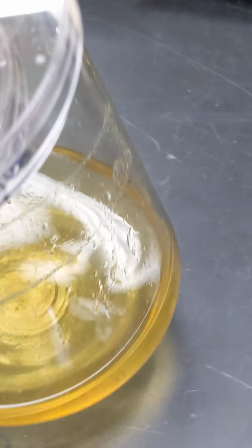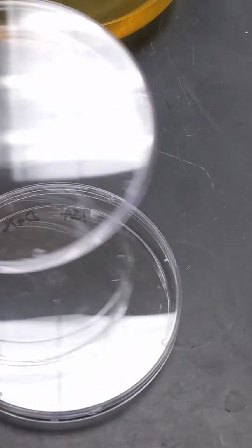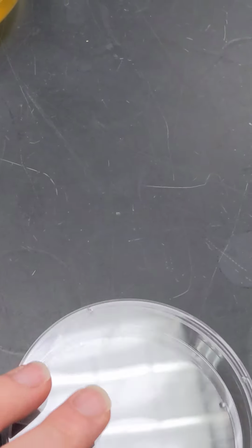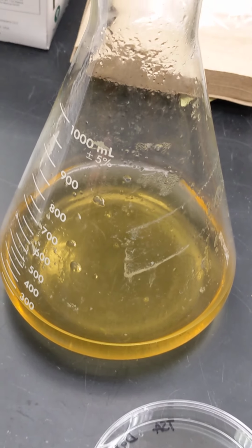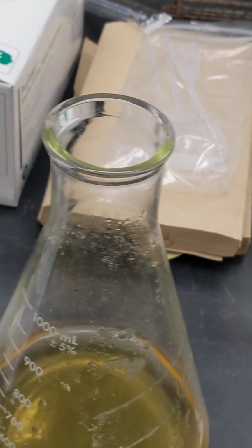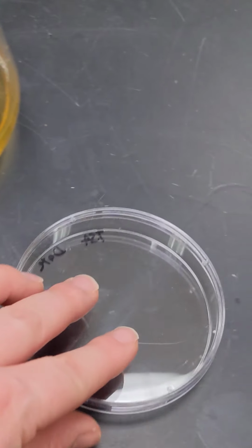Making these is really quite simple. So I would have a plate which I've labeled with my media type. Here I've labeled it with TSA. I would normally do this in the hood, and in the hood I would sterilize the neck of the flask under a flame before pouring it into the dish.